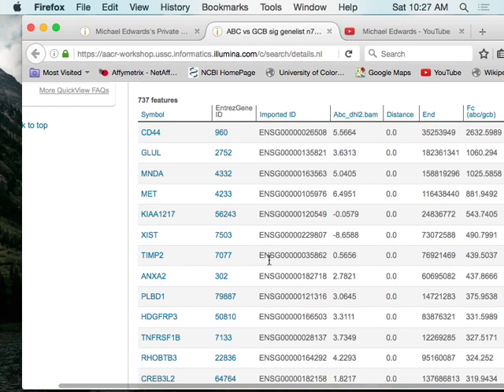What's the number one ranked gene in this gene list? CD44. Anybody heard of CD44 before? Yeah. When you ranked them, remember SeqMonk ranked it by p-values. Does anybody remember what the top gene was at that point? It's like BCL2, like 281. You always correct me. Yeah. Why is it ranked differently?